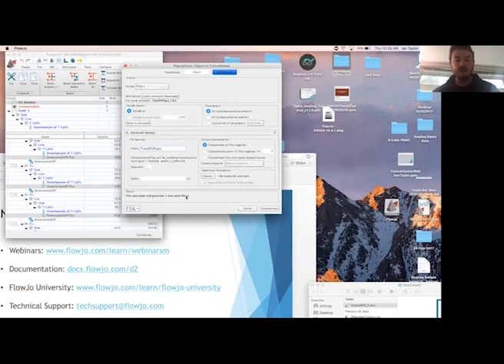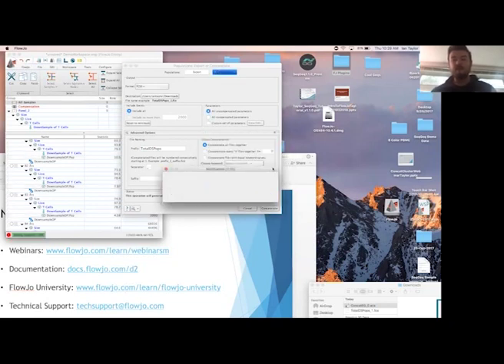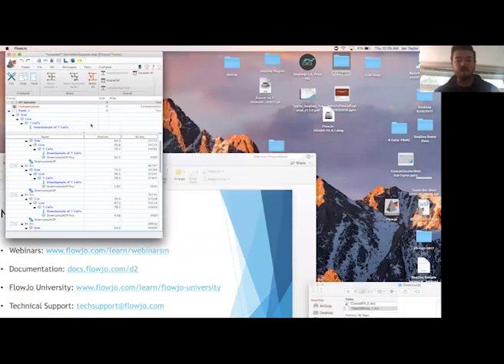And it looks like we're going to generate one new data file, and that's exactly what I want to do. So I'll go ahead and concatenate. And I'll open that in this existing workspace in case I ever want to compare with something that happened there. Let's make sure that this will work. Oh, cancel this.